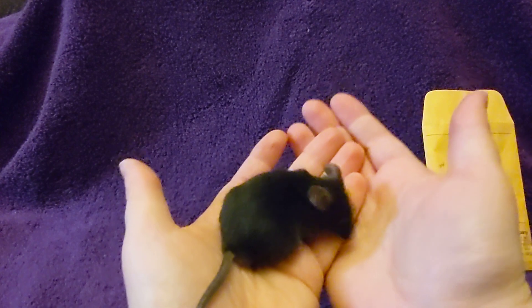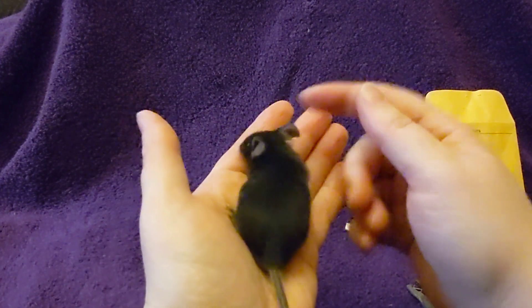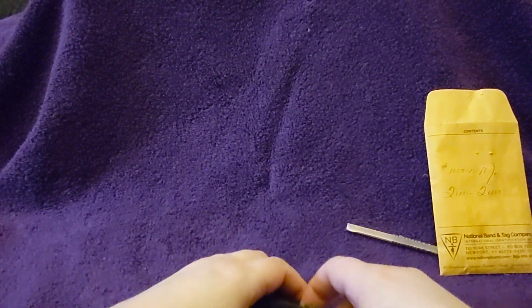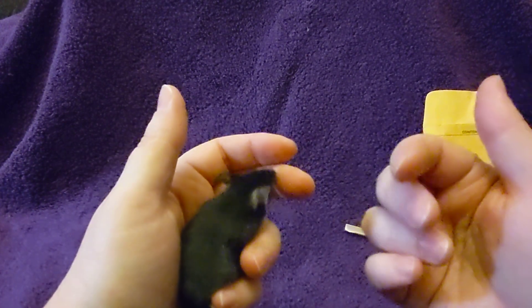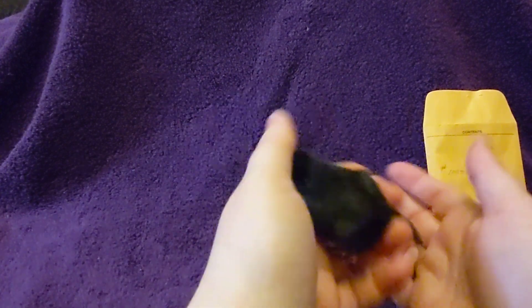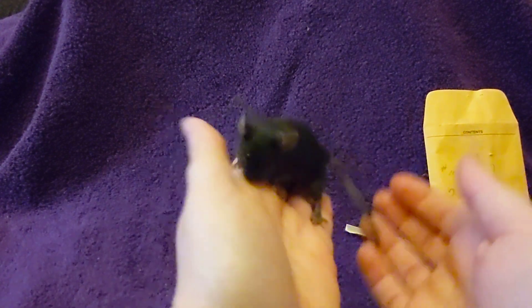Okay, so this is our mouse. We are going to put the tag in his right ear. When you look inside the ear — it's going to be hard to see on this video — but there are two small ridges inside the ear. You want to get the tag kind of in between those ridges. If you put the tag too far outside of the ear it can rip out really easily, or they can get their paws stuck in it. And if it's too far in the ear it can affect their hearing and it can get infected with stuff that comes out of the ear.